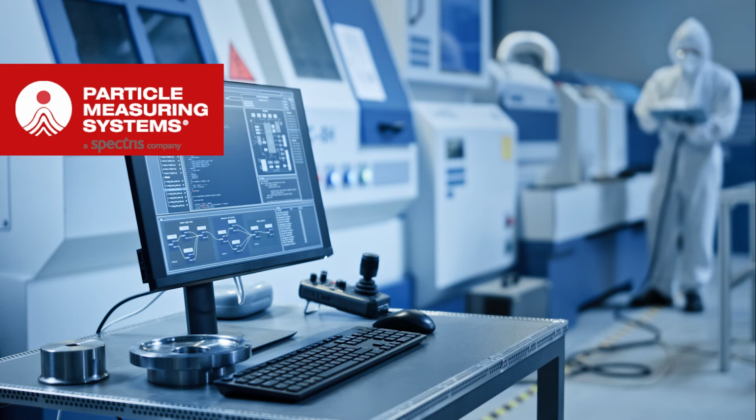But there are some places, even in the class ISO 7, ISO 8, grade C, grade D rooms, where a continuous monitoring point in a uniformly distributed environment will give you a really good impression as to what's going on. And so we're able to balance the number of locations versus the frequency, and that then leads to the quality of data.